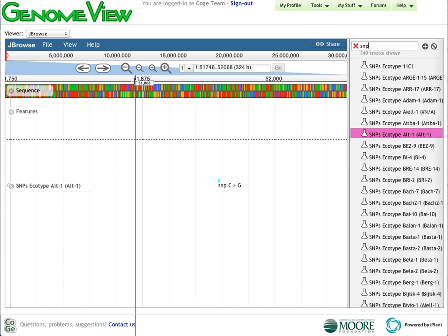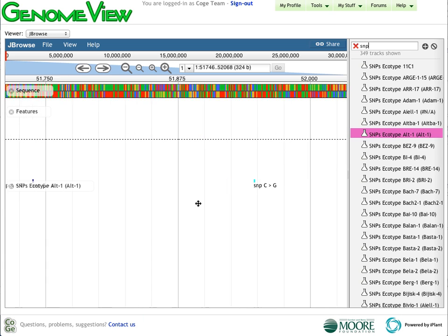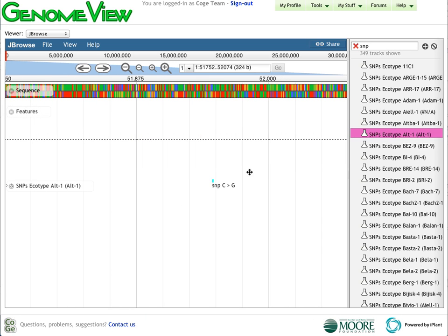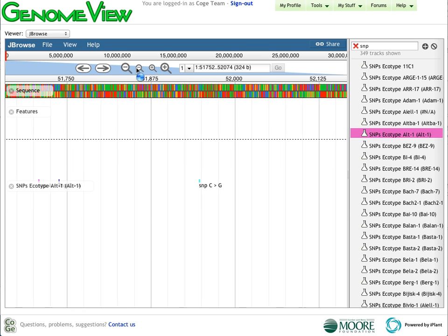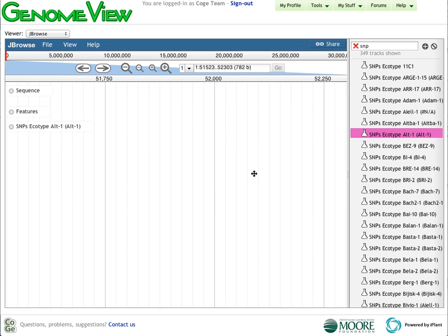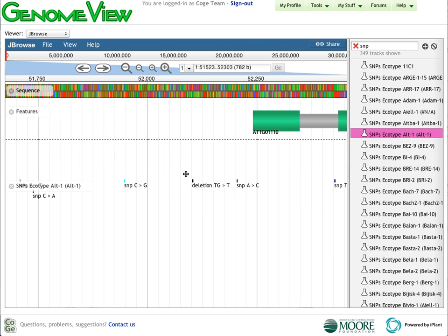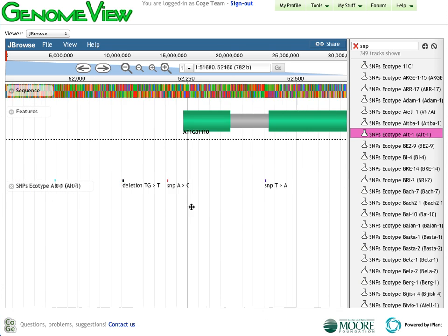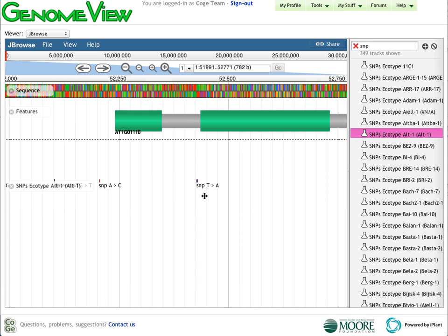As I get closer, we start to see how these SNPs actually are. So here is a C to G conversion, an A to C, a T to A, and we can see their relative position within gene models.